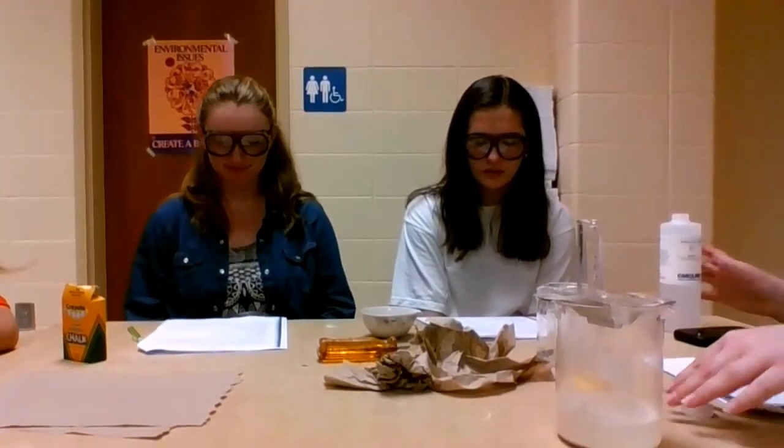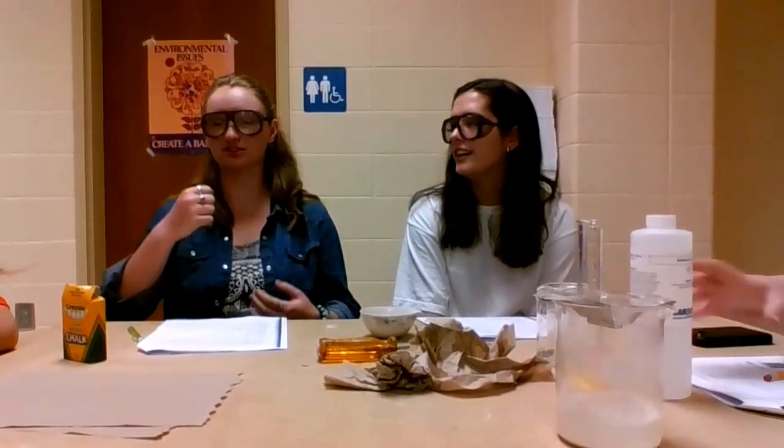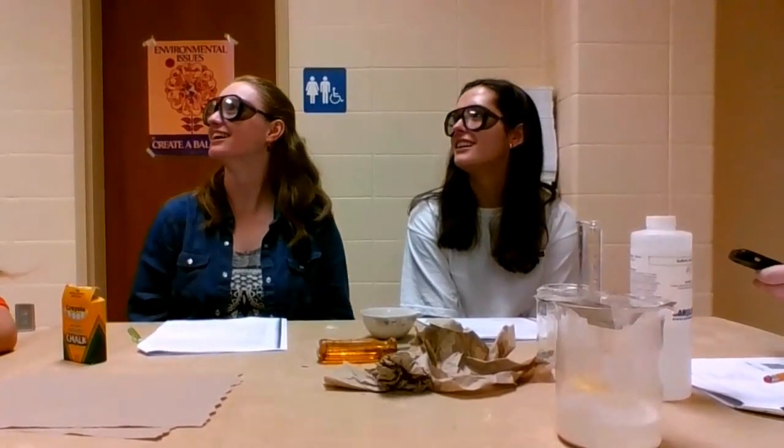Who wants to wash this out? I should put the lid back on this for safety. For 5 minutes, who's counting? We can pretend like 5 minutes has passed. Count to probably 300.